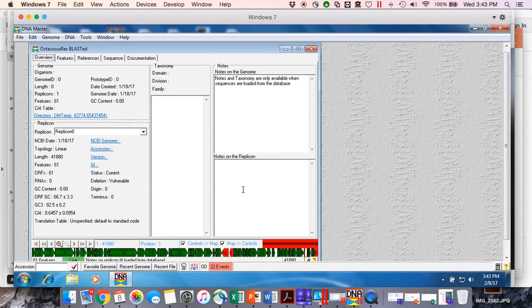Now, we left off in our annotation guide at page 39, where we blasted our file. And on page 39, they talk about the blast results. We will get to that when we start using that data. We're going to skip ahead in the annotation guide at this point. So chapter 5 starts on page 41. You really don't need to know much about chapter 5 because we don't use some of these tools. The tools that we do use, we will come back to in chapter 5.